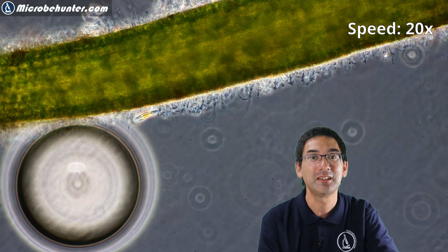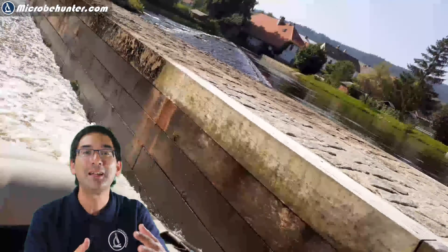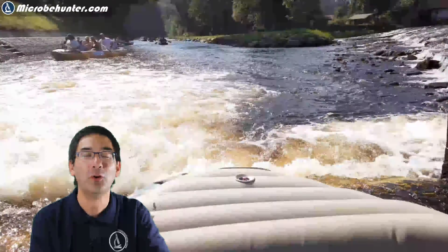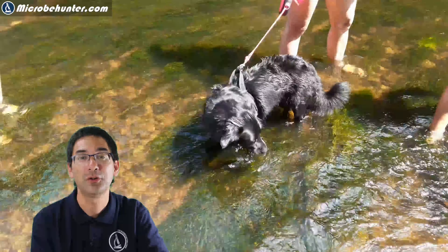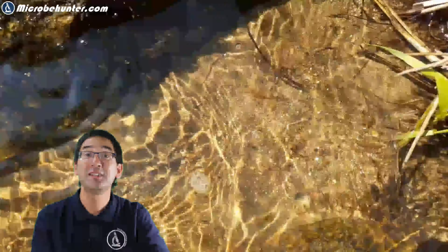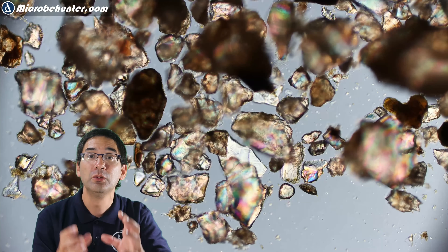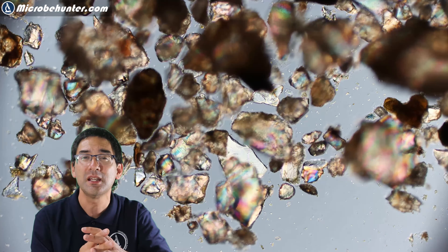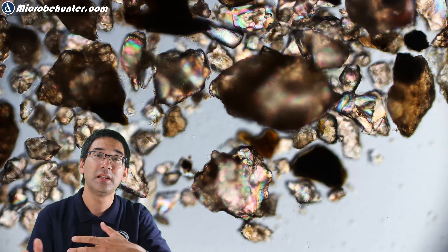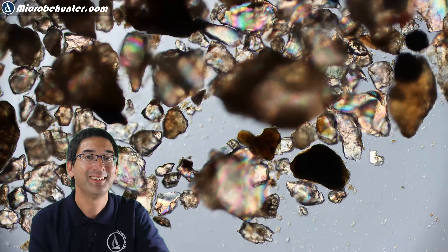Here we can also see a slowly growing oxygen bubble and some other movement — possibly a ciliate or flagellate. At the next little waterfall, with all of the foam, you can see that air and water are really quite well mixed together, which also brings carbon dioxide into the water for the water plants to use for photosynthesis. The water here is very clean with very few floating particles, so I also put a little bit of sand under the microscope to have a look at the so-called interstitial fauna — the living things found between sand grains. Because the river was flowing so quickly, many microorganisms may have had difficulty settling there, but I was lucky to find a diatom.